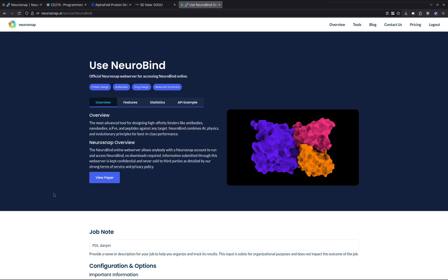In this video, we're going to be showing you how to use the NeuroBind model to design protein-based binders against PD-L1, which is a therapeutically very important protein, directly on the NeuroSnap platform.